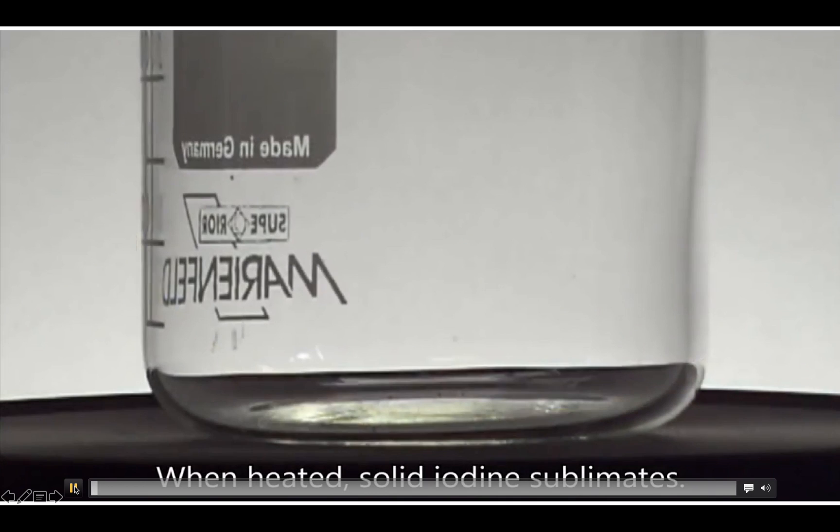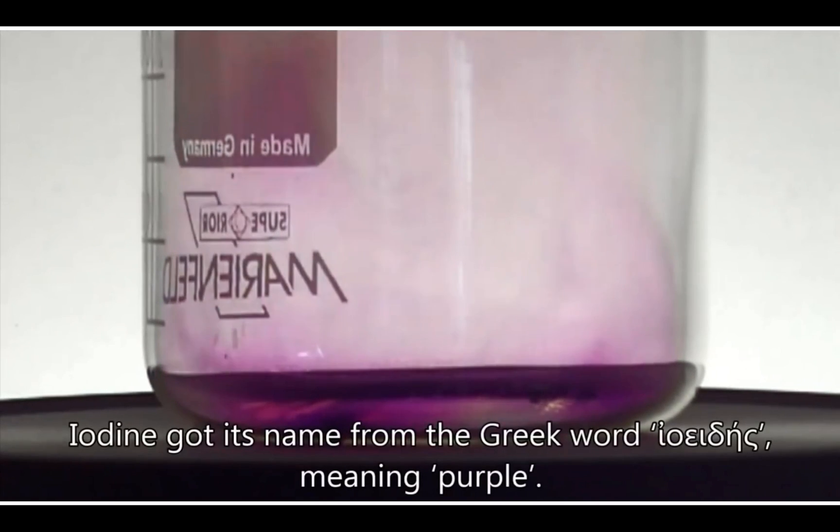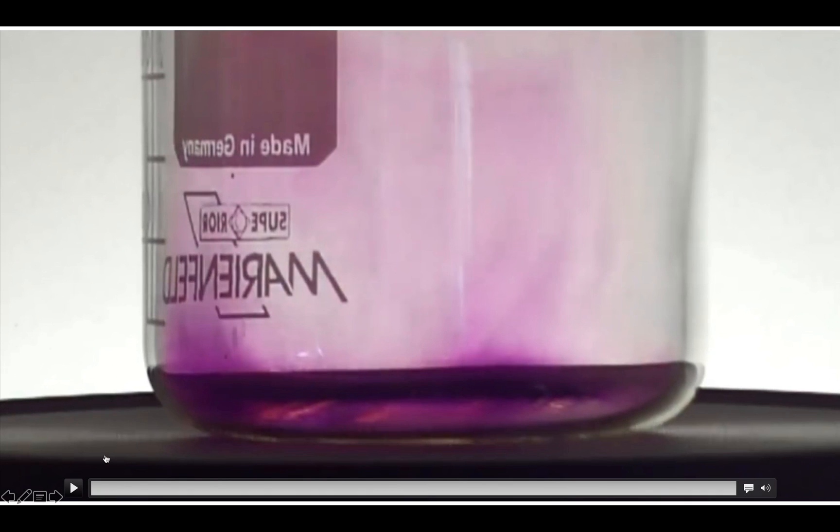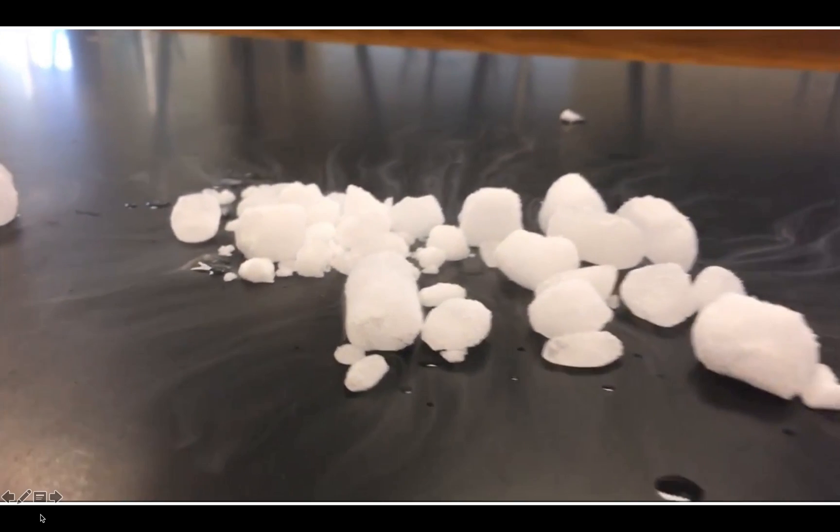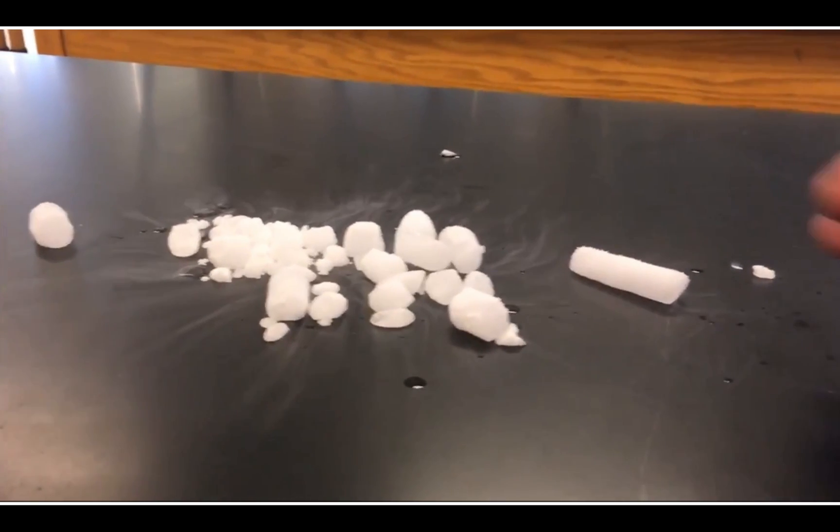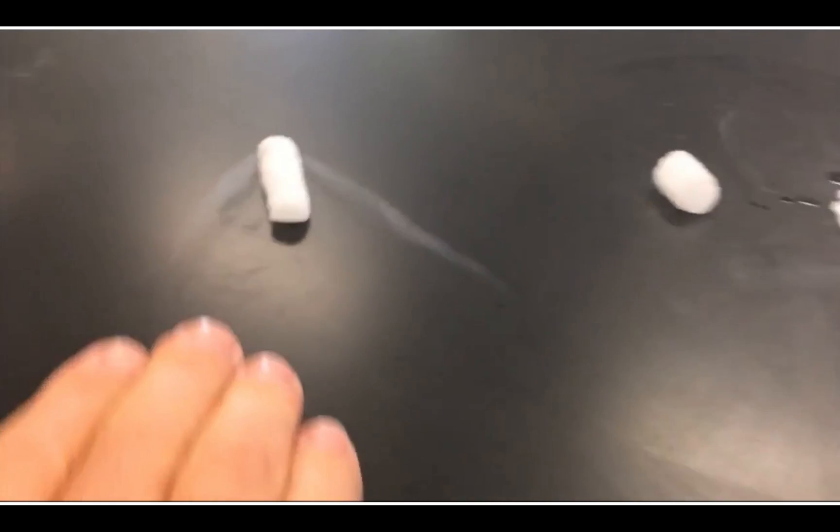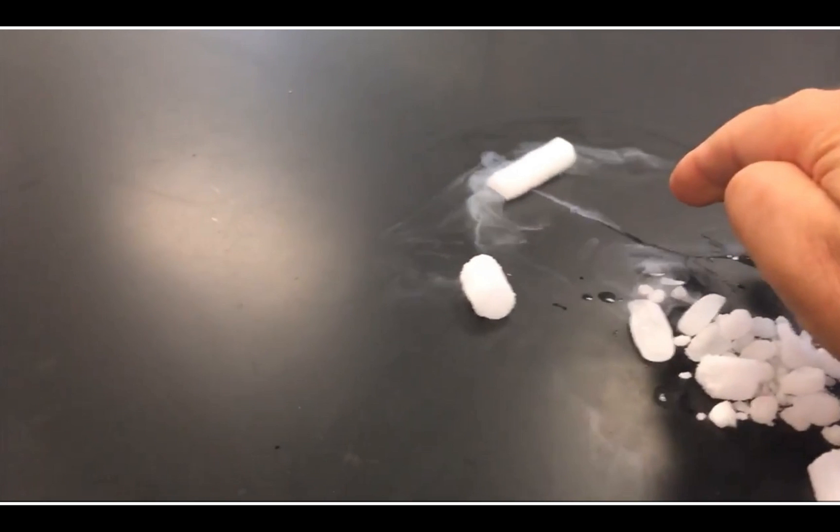Here is iodine subliming—solid iodine pellets. They turn straight into a gas. And then carbon dioxide is another element that does that. So this is solid carbon dioxide, and you can see it going straight to a gas. So that's sublimation.